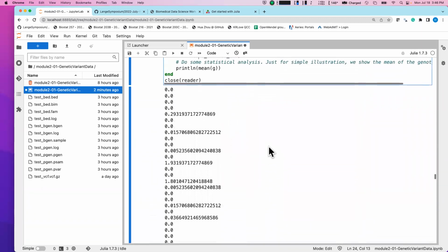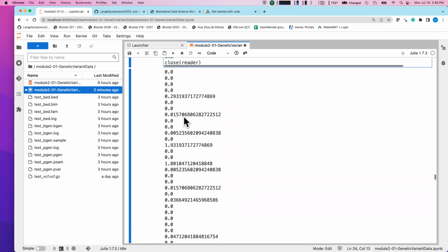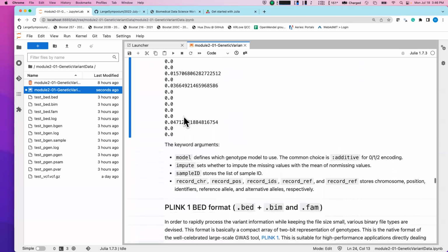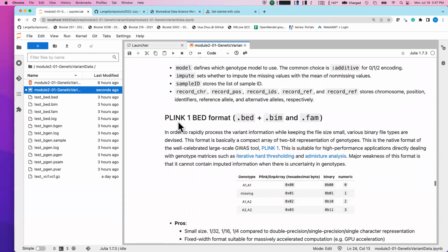Some means are 0, means those are monoallelic. Is that what you mean? That is right. Everything is 0 in those variants. But it's just a small sample, yeah. A small section of your whole data. Yeah, it is just 191 people. A small section of a huge pool of people, I guess.